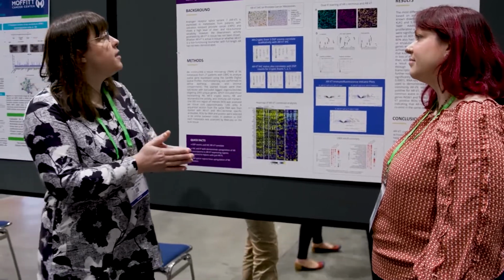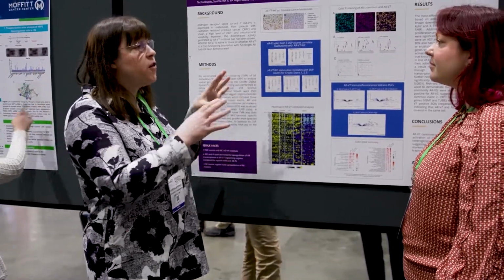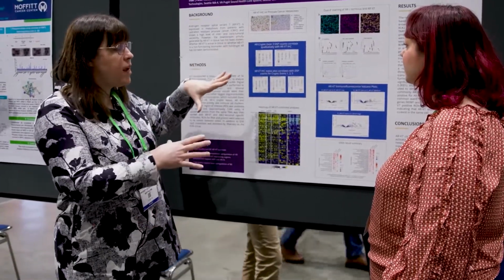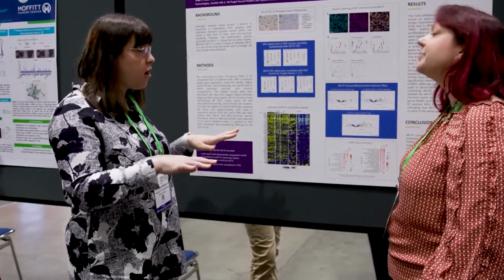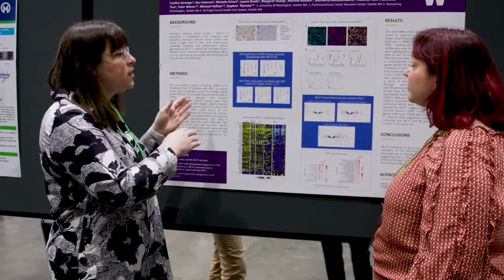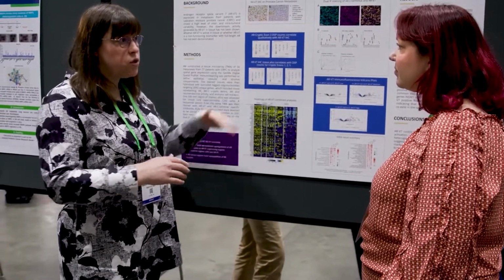And this was great because Nanostring actually had included in our RNA probes ones that were specific for AR variants. So we have ARV7, we have ARV9, and in particular when we stain, we have an antibody that's very specific for V7, so it differentiates it from the full-length AR. And there's a nice correlation between these DSP probes for the variants versus the full length. So that was really nice to see that our staining was actually correlating with the increased counts for these probes.